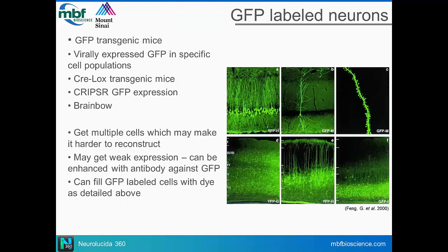In addition, there's GFP, and many labs are now crossing GFP mice with their disease mouse of interest, and you really do get quite beautiful images of neurons. As you can see in the top left panel, there's this whole sea of neurons. While that's really nice, it's a little difficult to reconstruct all of that, because you will have a lot of overlapping dendritic segments, whether they are far enough apart in the Z or close in the Z, and that could really be a problem for reconstructing.